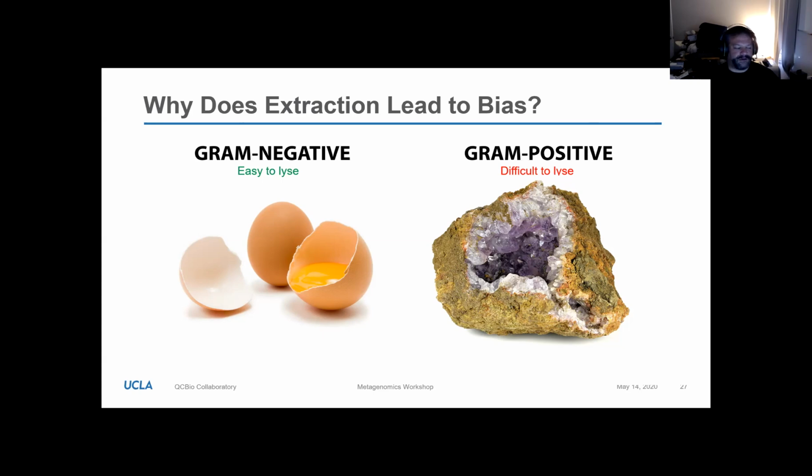And that's because with E. coli, if you just put them into an alkaline solution with some detergent, they disintegrate. That would be as compared to something like Listeria, where if you could somehow get your plasmid into Listeria, you'd actually get back only about 50% of the plasmid that grew up, because the best a lot of people can do is maybe getting half their Listeria lysed with the same method.